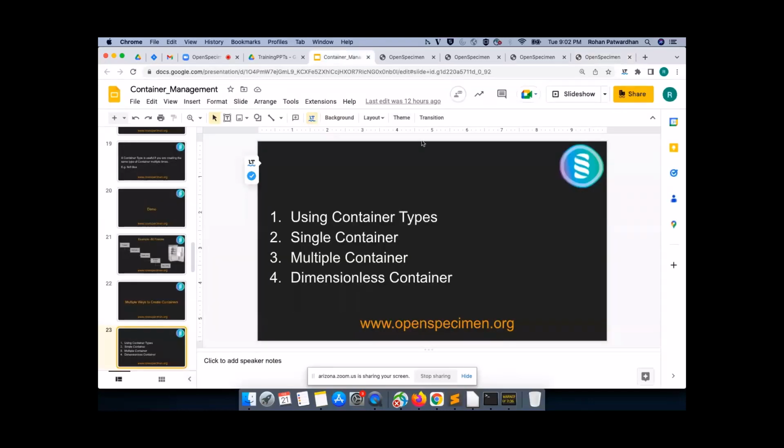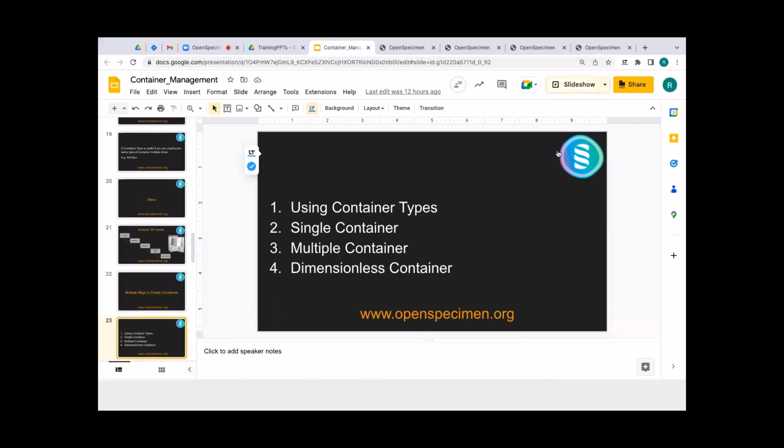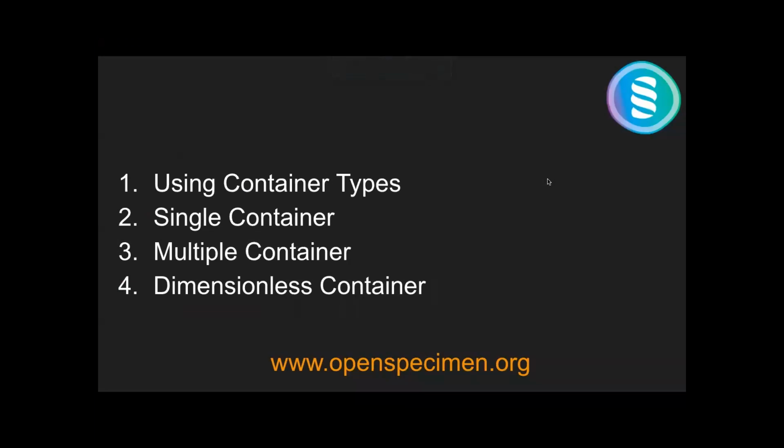I just want to understand from you how the freezers are maintained within Arizona. Is it a central facility, or are they managed by individual groups? They're individual groups. The Able collections will probably all be together though. Okay, because Able Collections is one of the largest groups within the Arizona University, isn't it? Hmm.